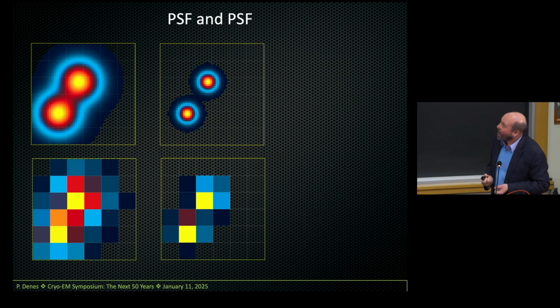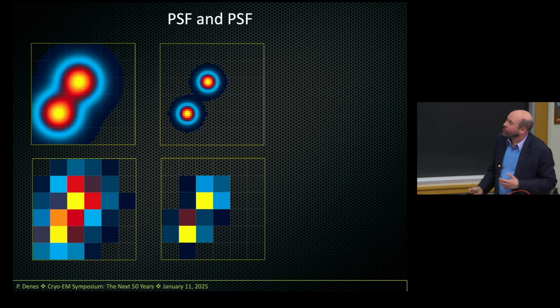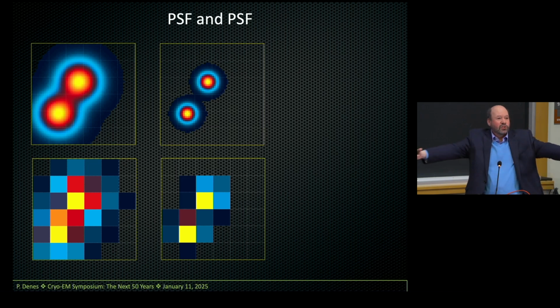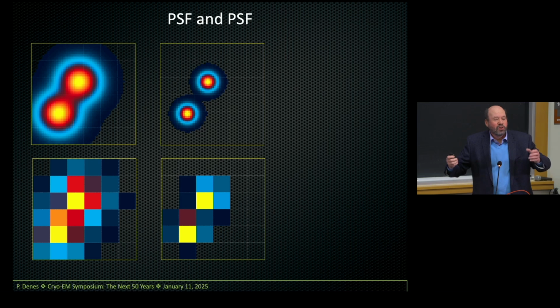Now where counting is different from just integrating is that if you simply integrate signal, like film, like your camera, then what you see is the point spread function in the sensor for each one of the charges, and that's the pattern that shows up on your pixel. So you very much want to have a point spread function that's smaller.